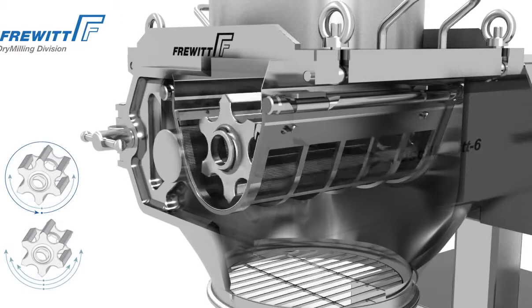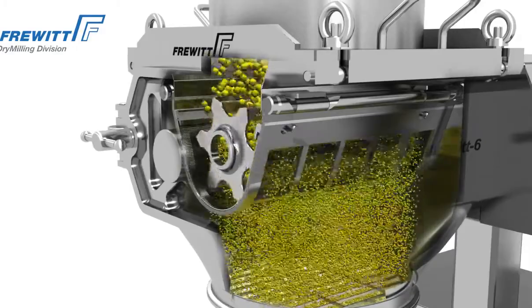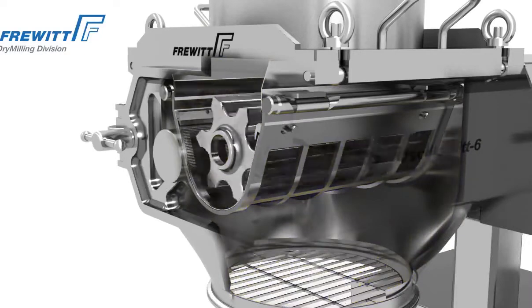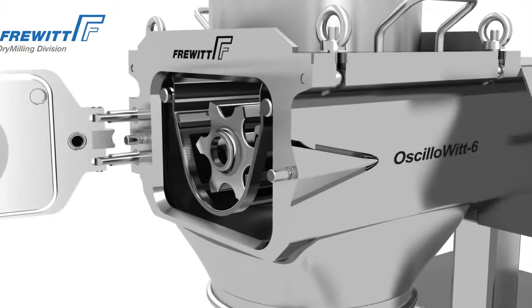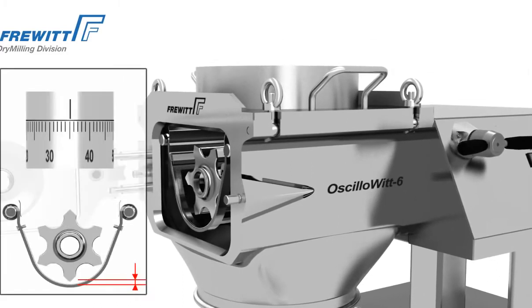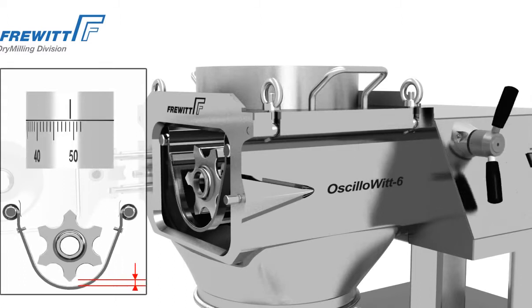A plus for exacting milling tasks in the pharmaceutical, chemical, and food industries. The adjustment mechanism, which is operated from the outside, enables continuous, precise, and readable adjustment of the rotor-sieve distance.